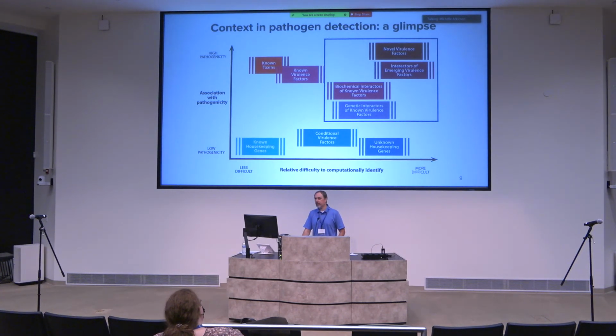But also, unfortunately, identifying all of these middle cases, where there'll be combinations of certain A, G, C, and Ts that you see across the genome that can influence this middle ground, makes it a harder computational problem. So unfortunately, the known stuff is pretty easy, but that's not capturing all of it, and you can't just look at that. And of course, there are categories of things that we know occur everywhere, and we know that those can never be harmful.